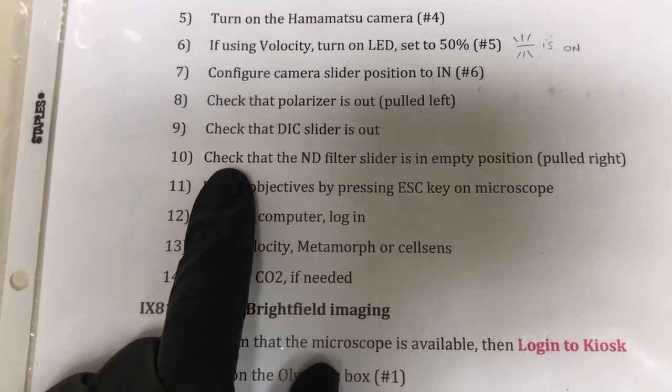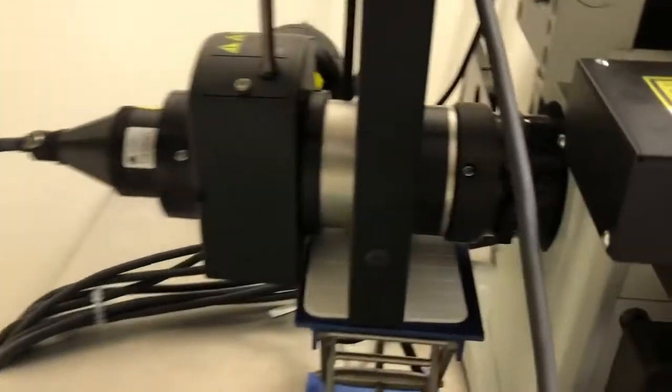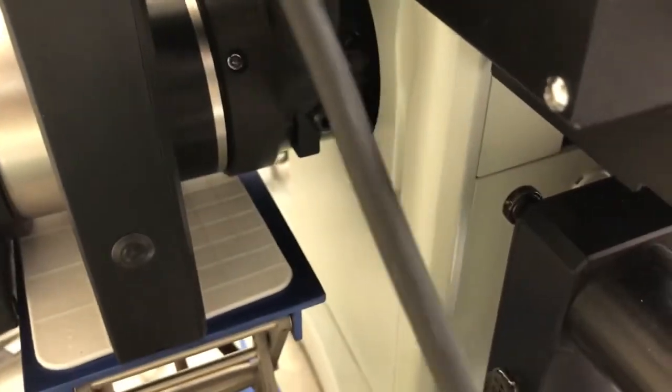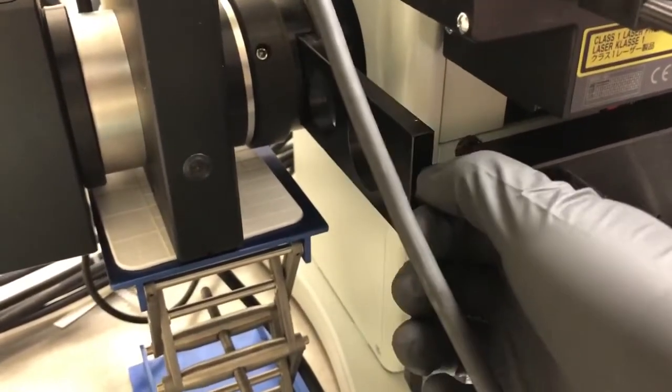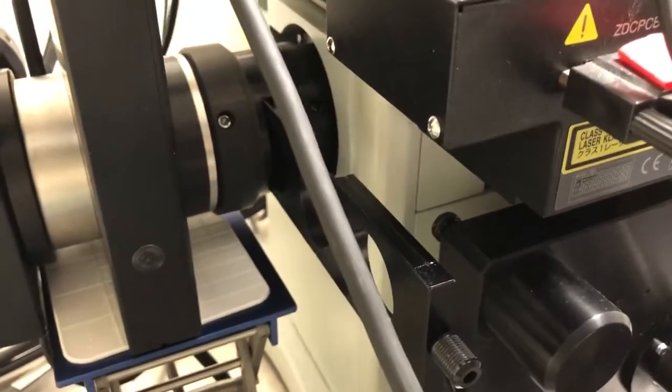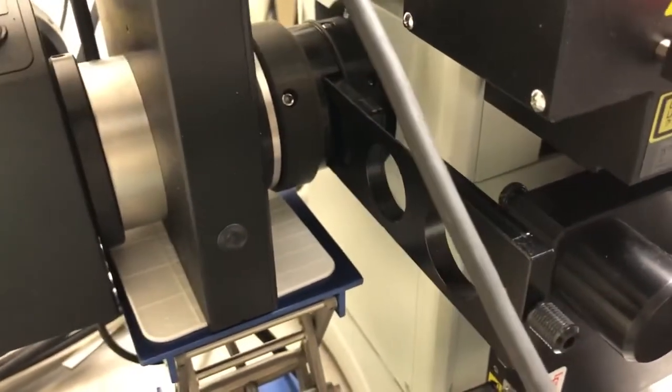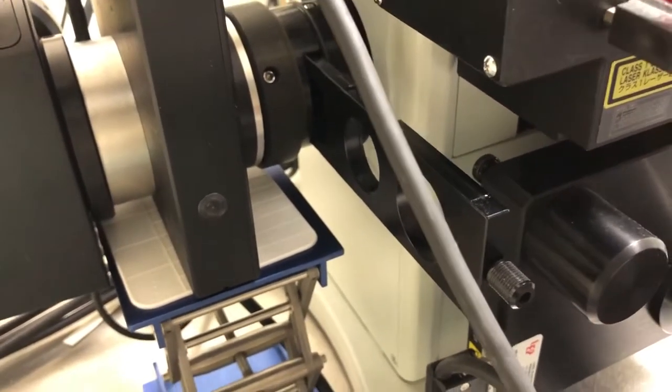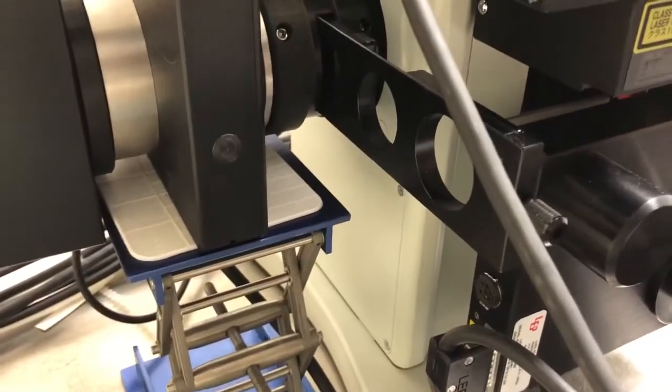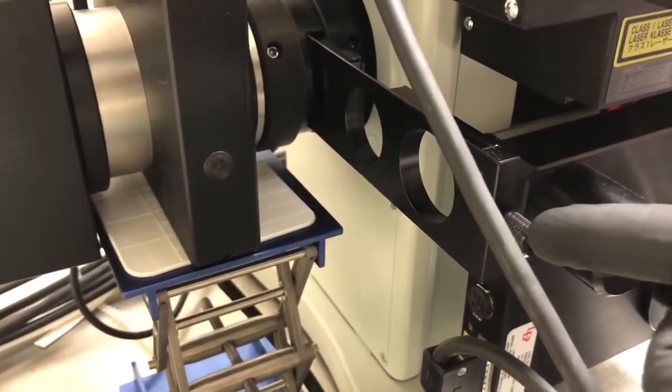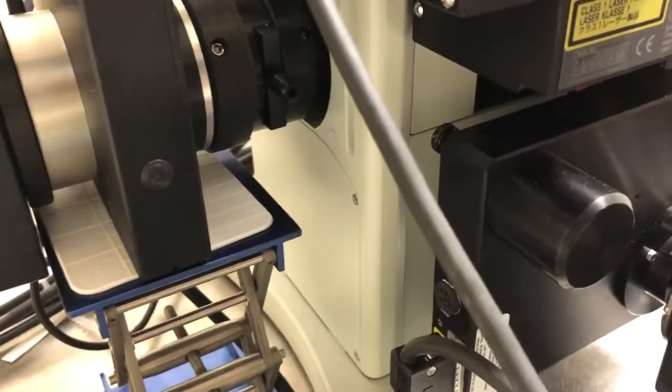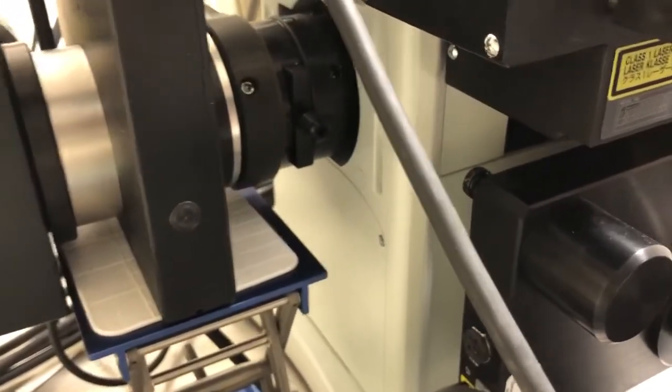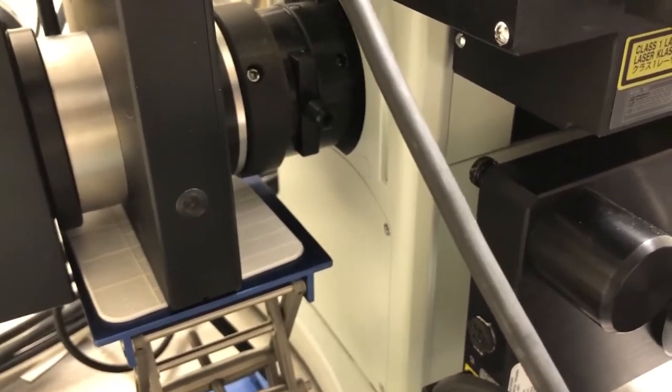If when you accidentally pull it out, you're not sure what orientation it goes in because it can go either this way or that way, there's a little drawing here that shows you how it's supposed to be inserted into that slot. Step number 10. Check that the ND filter slider is in the empty position. So at the back of the microscope here, there's a slider which can be pulled from multiple positions. And in one of these positions, there are some filters that block a large percentage of the light that goes into the microscope. Those are used for live cell imaging. Unless you are doing that and people typically are not doing that, for most of you, you just want this pushed all the way to the right or pulled all the way to the right. So in that configuration, we'll just let the full amount of light through.